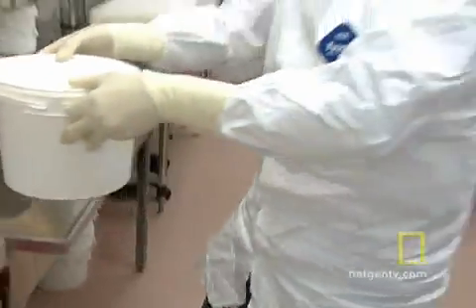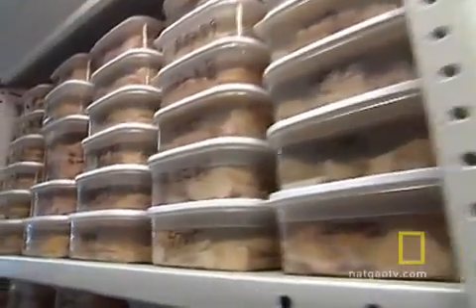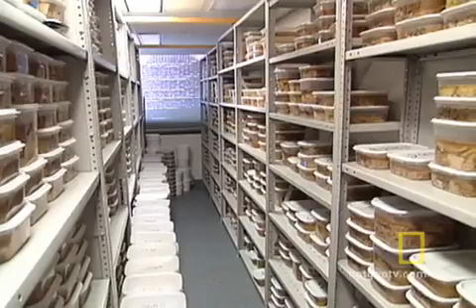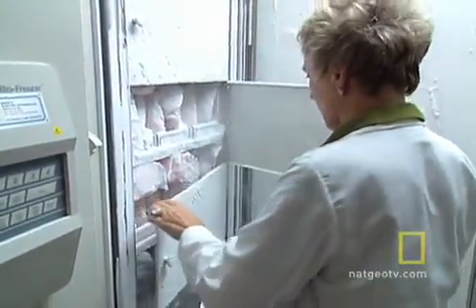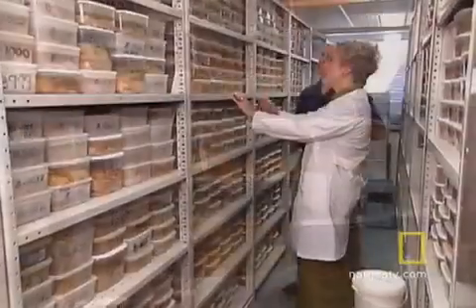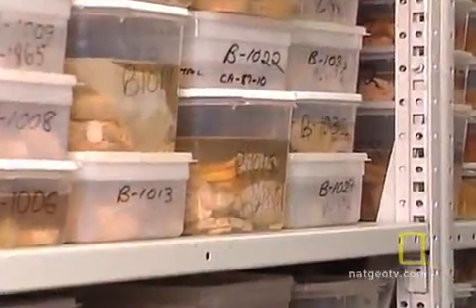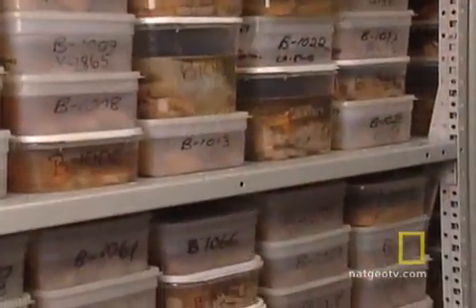For the Harvard Brain Tissue Resource Center, also known as the Brain Bank, this is one of over 7,000 brains. It's by far the largest brain repository in the world, a veritable stockroom of intelligence, packing freezers and lining shelves. For more than 25 years, the Brain Bank has been collecting and doling brains out to neuroscientists looking to unlock their secrets. Each of these numbers represents a donor. Francine Benes is the Brain Bank's director. To find more effective cures, we simply have to study the brain. There's no other way around it.